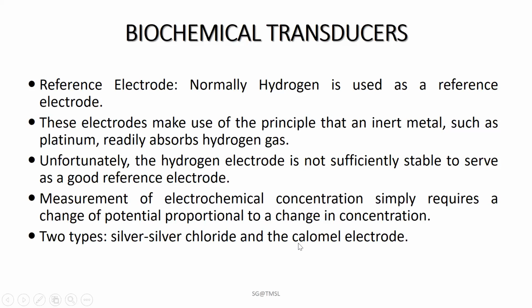In electrochemical measurement, the silver chloride electrode is very stable. This type of electrode is prepared by electrolytically coating a piece of pure silver with silver chloride. The coating is normally done by placing a clean piece of silver into a bromide-free sodium chloride solution, and a second piece of silver is also placed in the solution.